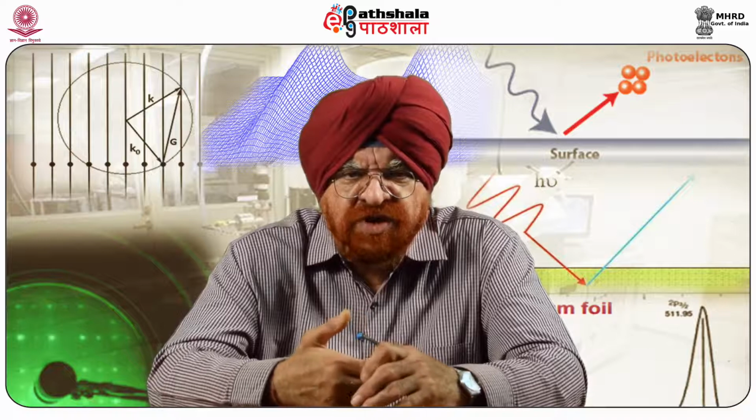The measurements were carried out under room conditions, that is, temperature and atmosphere obviously fixed, from a 1.7 micrometer thick film deposited on crystalline silicon.